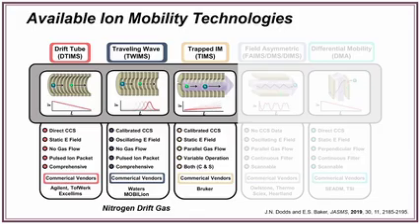So the larger ions come through first, then the smallest. This also needs a calibration process to get collision cross-section values. The process is about the same as on the traveling wave instruments.